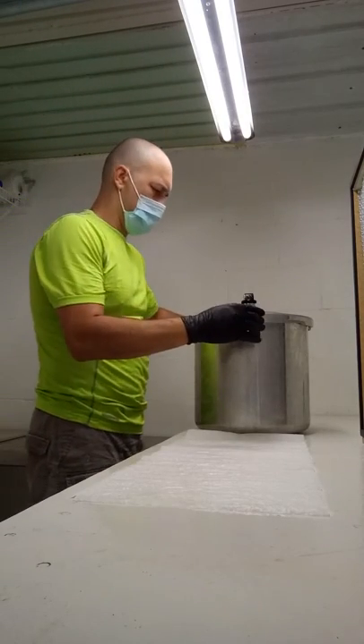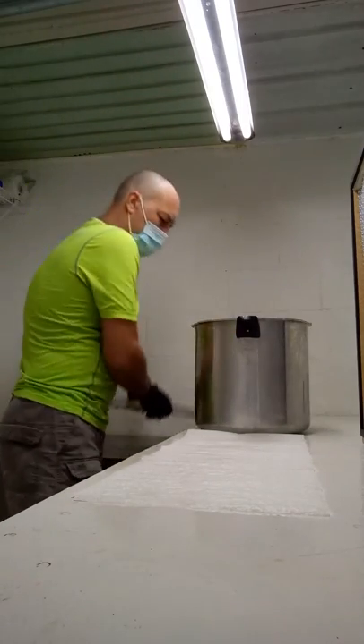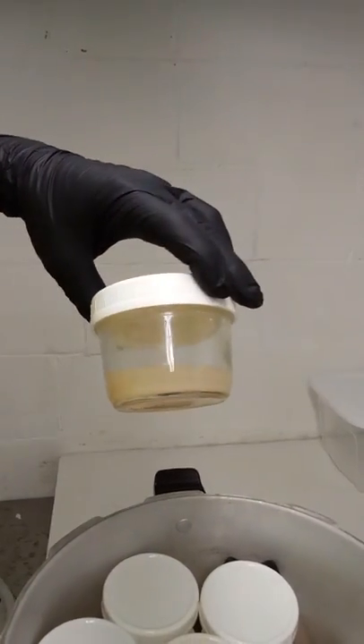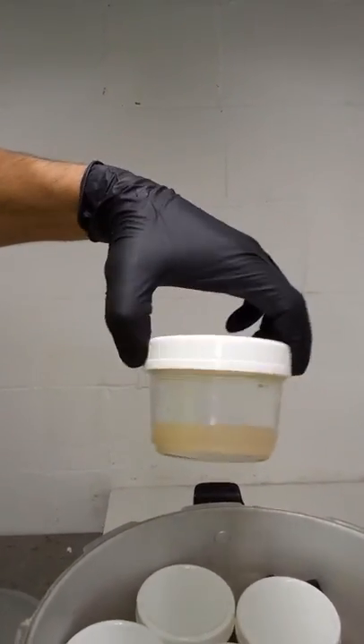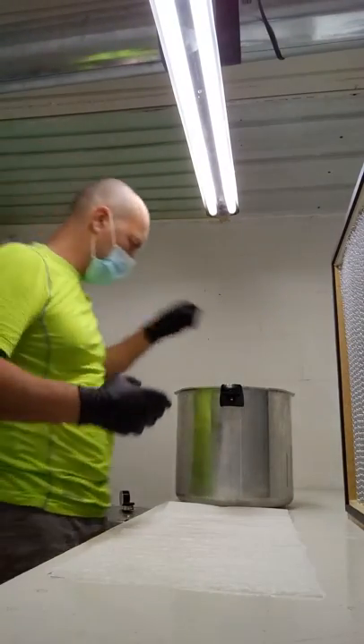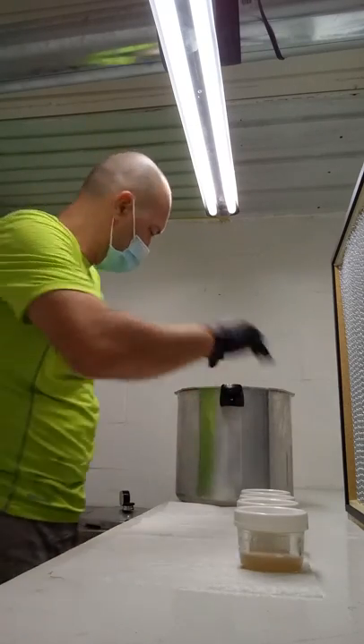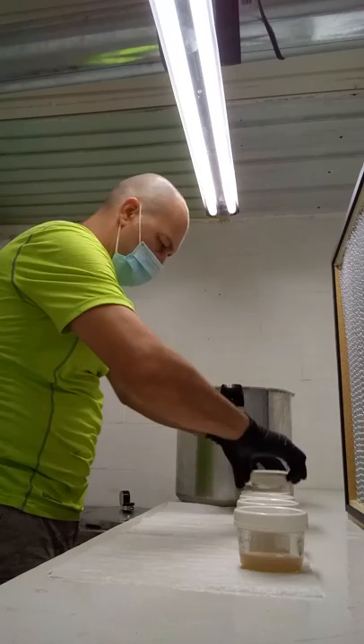I'm going to open it and give you a real quick view of what it looks like in there. Pretty much these are agar dishes, but in a wide-mouth mason jar, along with master slants that I'll be inoculating soon. They've been sitting for a couple of days, so they're nice and solidified.